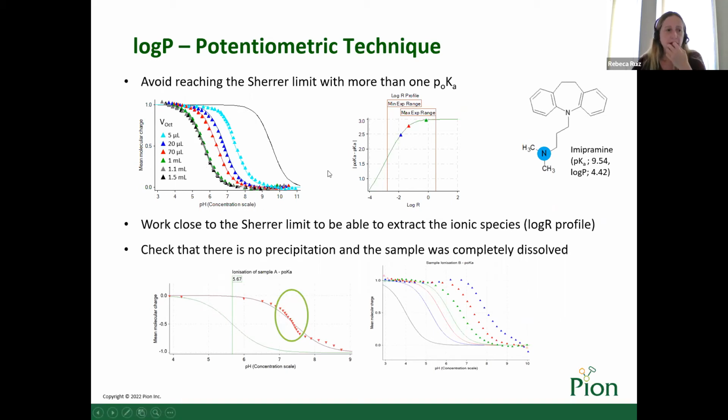Then, for the people that normally use the log R graph, the best log P design is located here in the corner of this curve. So one titration on the Scherrer limit, one titration more or less in the corner, and another on the slope.